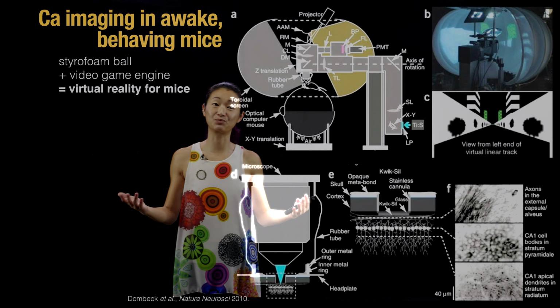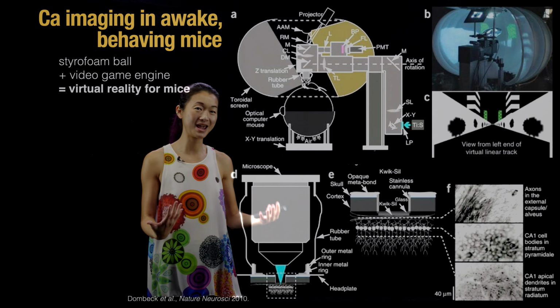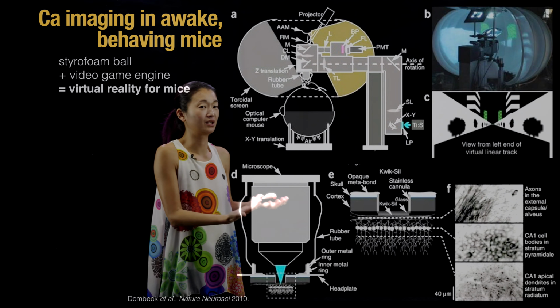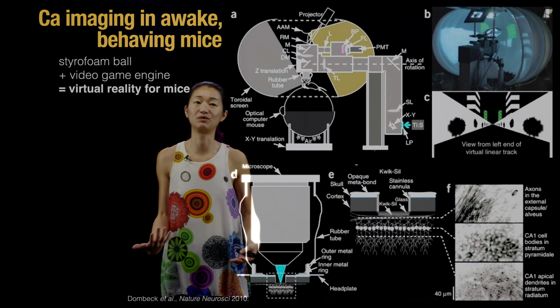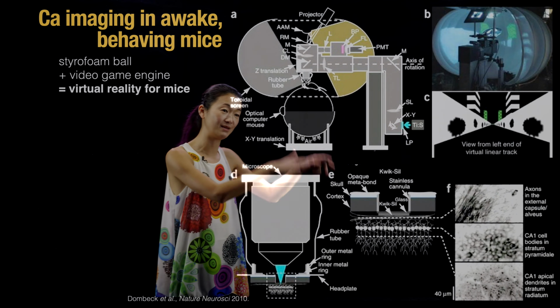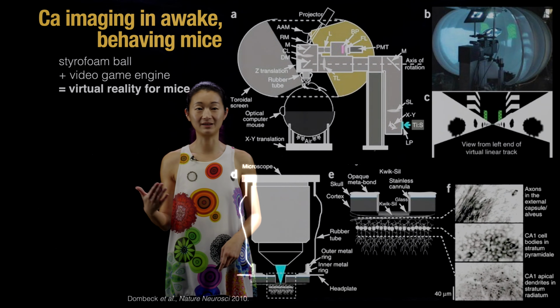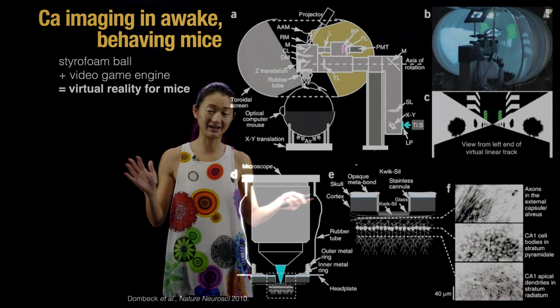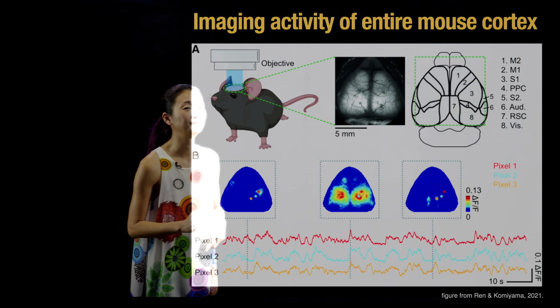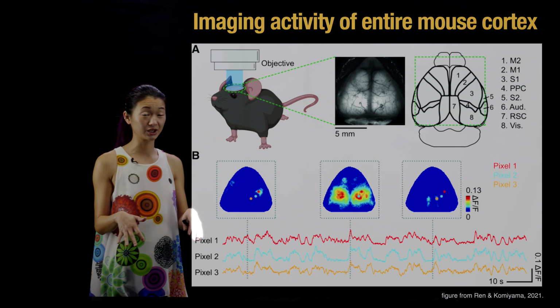But with a mouse, it's running through a maze in a way that is semi-credible, and it's able to behave in a way that is relevant for the animal, and solving a task that's actually relevant for the animal because it's really good at navigating because it's a rodent, right? So this is a really cool experiment that's enabled by calcium imaging, and you can actually image all the way down into some deeper structures in the brain as well, because tricks were played so that it was optically relatively transparent. So that's imaging down into the brain at pretty good resolution.